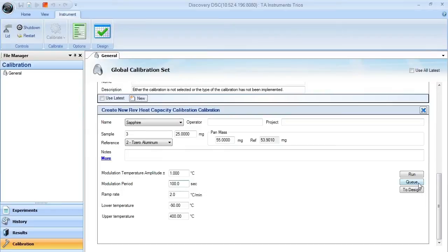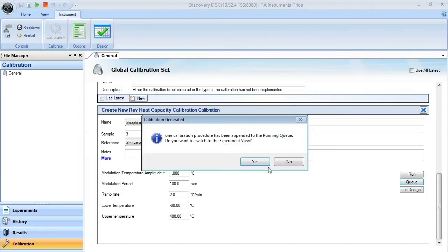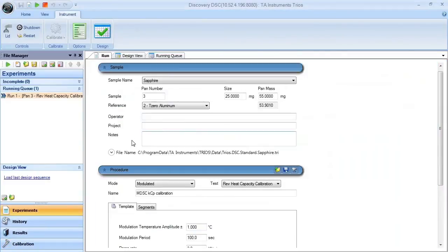Or we can press running queue button where we are prompted to be put into the running queue. Once into the running queue, we see that everything is correct, we can say start experiment.